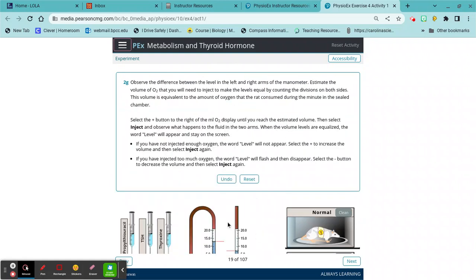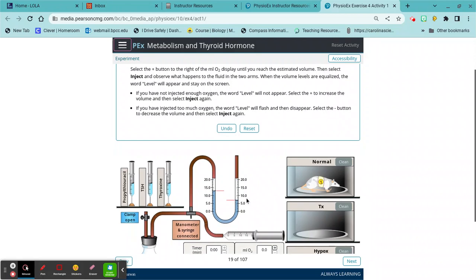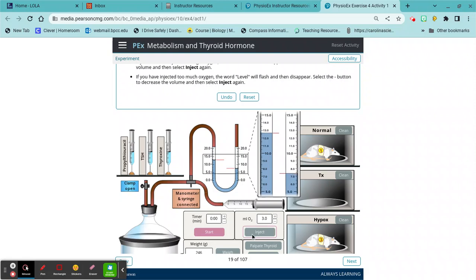Okay, so now we're going to do the inject thing that I'm not really good at. Let's see. So I'm going to say 1, 2, let's start with 3. I'm sorry, it should be going. No, that's right. Let's start with 3. I'm sorry, this is not my favorite part right here. I'm like, click, click, click. And let's inject and see what happens and see how much we need to move.